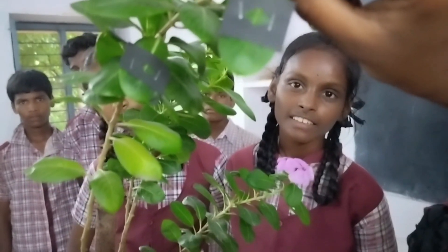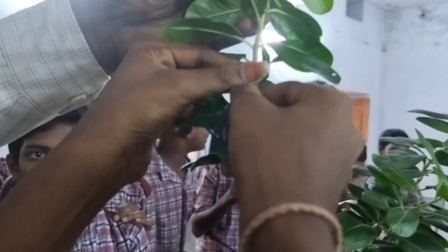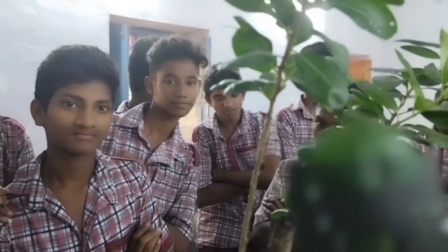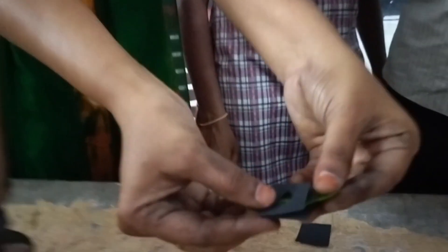We have to put this plant in sunlight for 4 hours. After that we detach the leaves from the plant for the iodine test. Now I am separating the black papers.